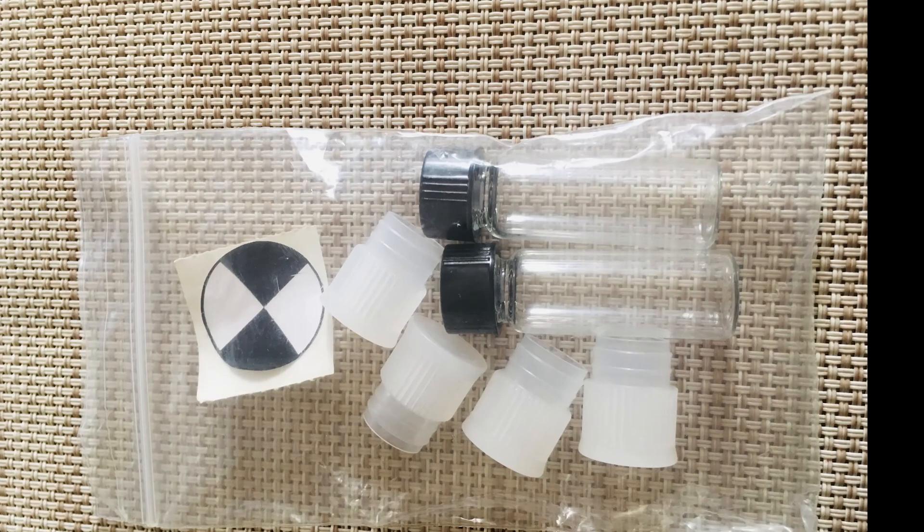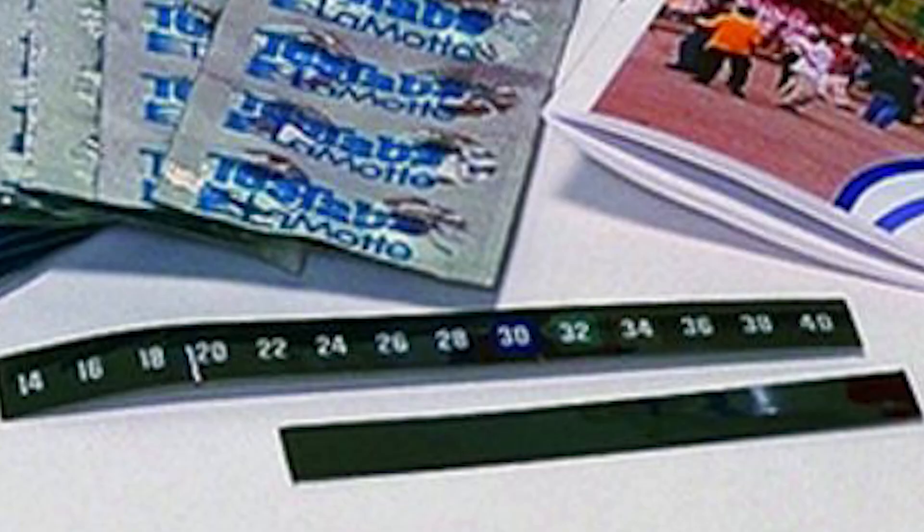In here you have the test tube and cap that are used to conduct the biochemical oxygen demand and dissolved oxygen tests. You can also find in this kit your thermometers.